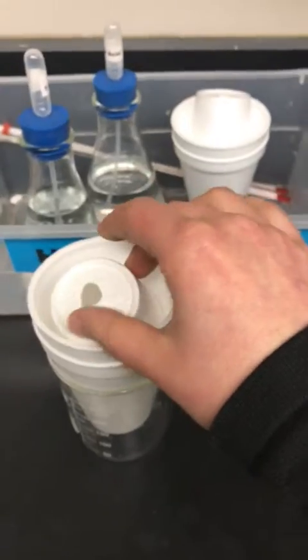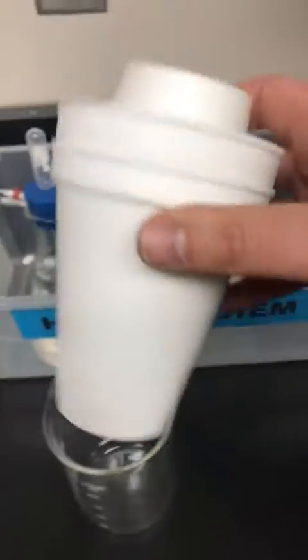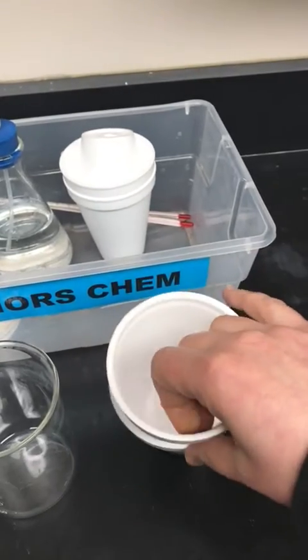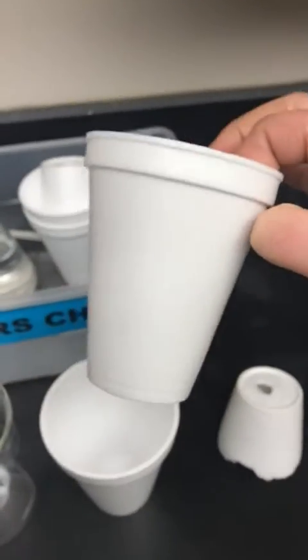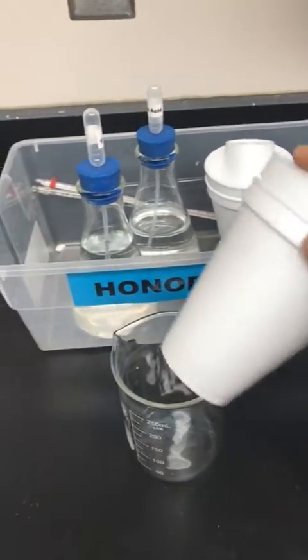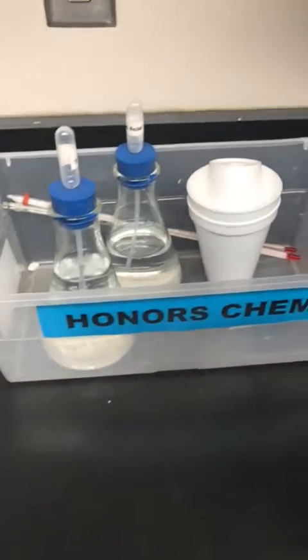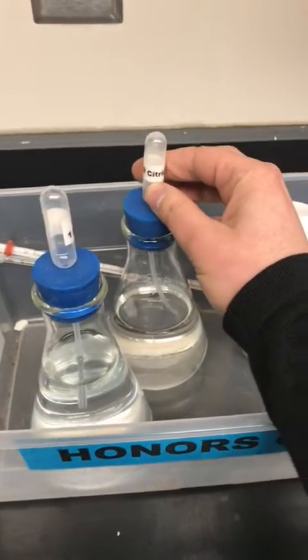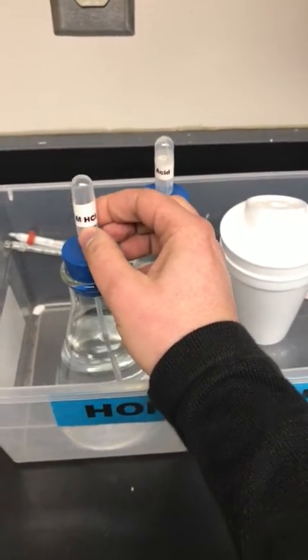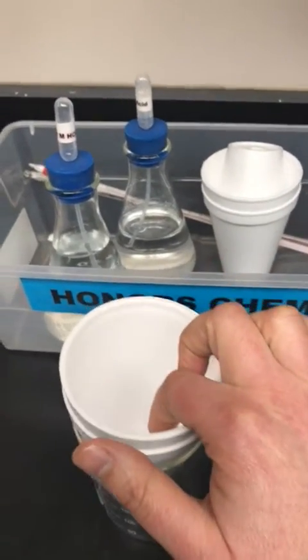And the first thing you want to do is mass your styrofoam cup. Now, you can choose to mass the whole thing, you can choose to mass just the 2 cups, or you can choose to mass just the inner styrofoam cup. It is totally up to you. Just be consistent. So once you mass your cup, you are going to place 30 milliliters of your acid in there. If you're doing the first reaction, you're going to use citric acid. If you're doing the second reaction, you're going to use hydrochloric acid. So you're going to measure 30 milliliters in a graduated cylinder and then pour it into here.